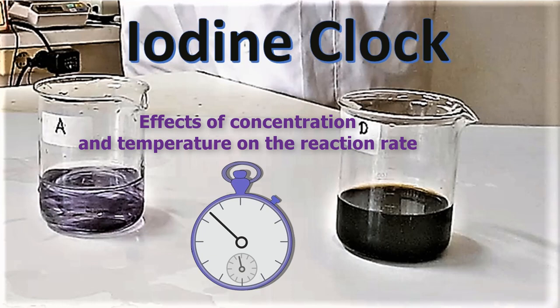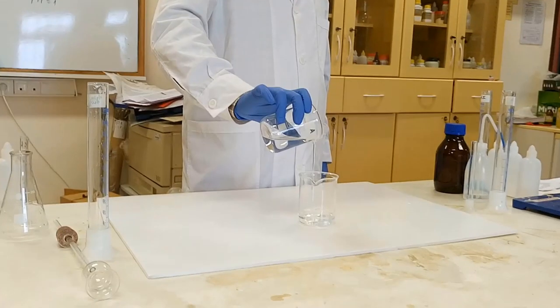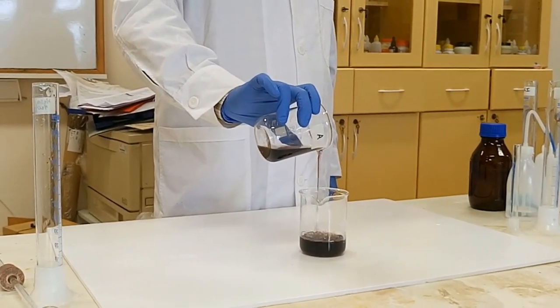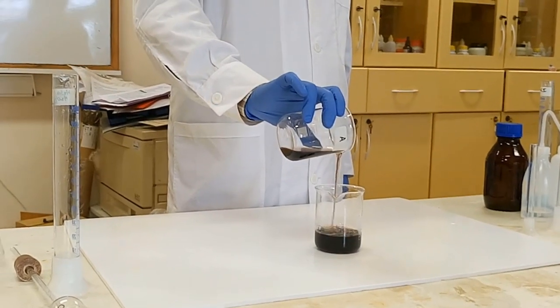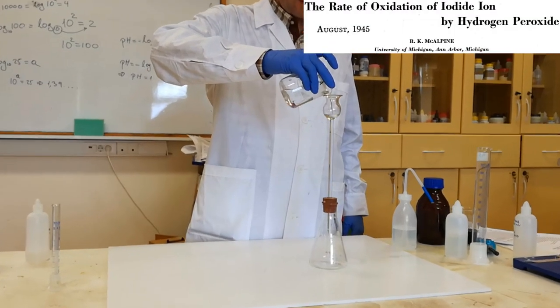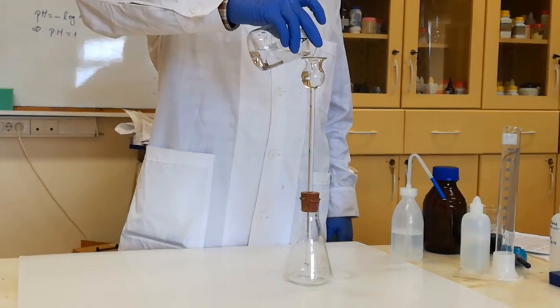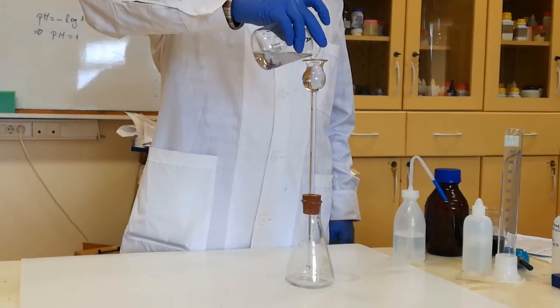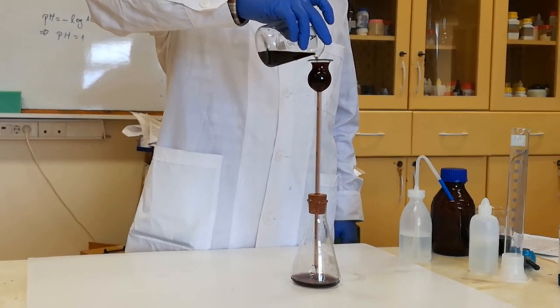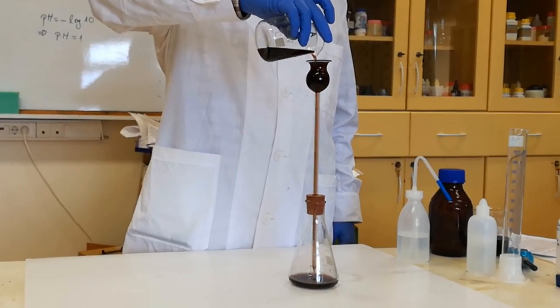Iodine clock experiment is most commonly used in jaw-dropping chemistry demonstrations with many different variants. However, it has been used for educational purposes too for a long time now. In this video, you will watch the use of iodine clock experiment in the study of reaction kinetics and specifically the effect of reactant concentration and temperature on the reaction rate.